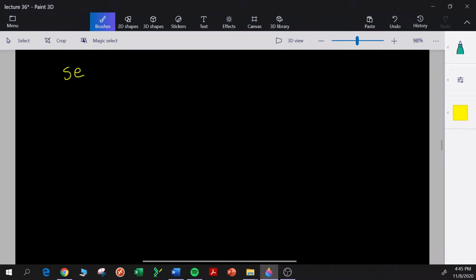So let's say the semi-solid support is the gel. So all the RNA is in that gel, but that gel, it's like gelatin. It's like Jell-O. So you have to be very careful with it, and we can't really detect specific RNA molecules when the RNA is in the gel. So we need to transfer that to a solid support. And the most common support used for northern blotting is a nylon membrane.